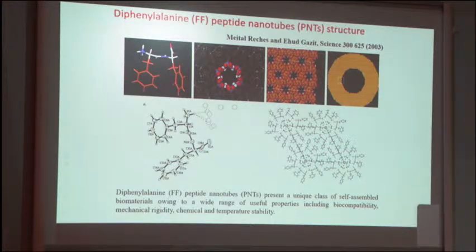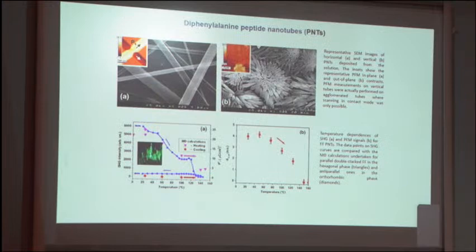Now, in dipeptides, maybe 10 or 20 different dipeptides are possible to grow like tubes. But an interesting situation is that dipeptide tubes show a very strong piezo response. You can see here the same image in atomic force microscopy, and this is piezo force microscopy.